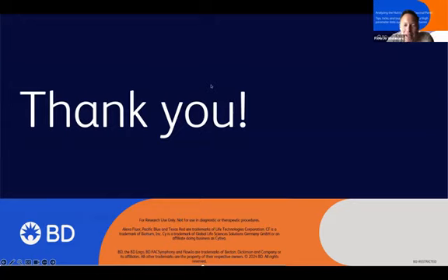All right. And Lauren said, at what point in the process do you apply the embedding algorithm? Good question, Lauren. So that is an after the fact kind of thing. It does allow you even, like, you could do it on the spot. You could say, I've got a whole bunch of data files right now, and I want to use some representative examples to make this UMAP plot. I say representative examples because let's imagine, again, the case we've got two conditions, healthy and disease.